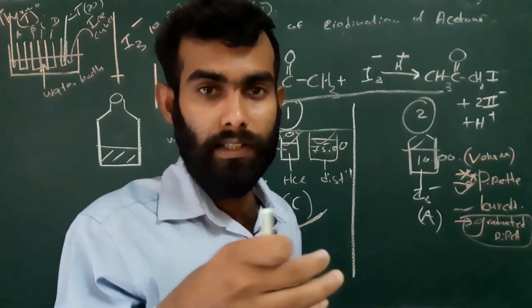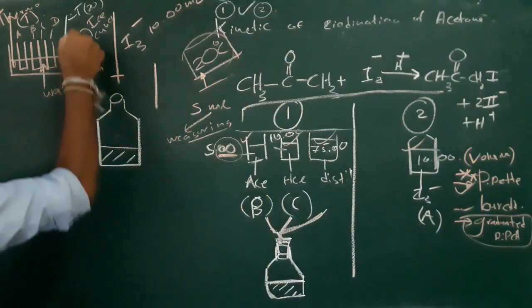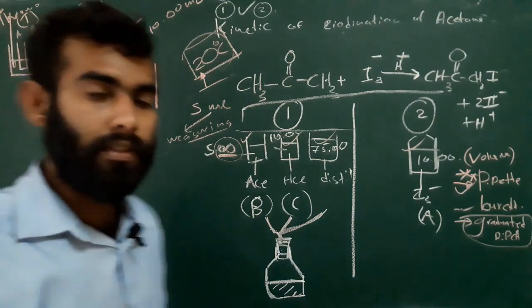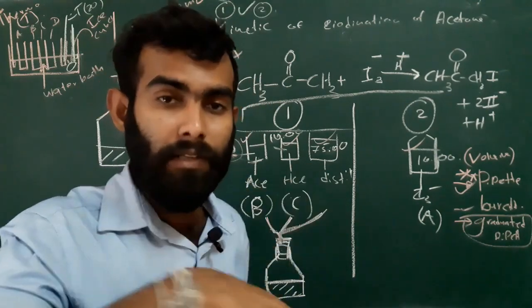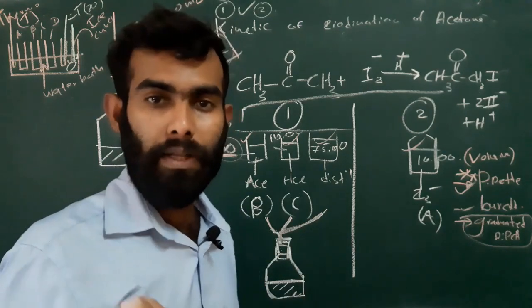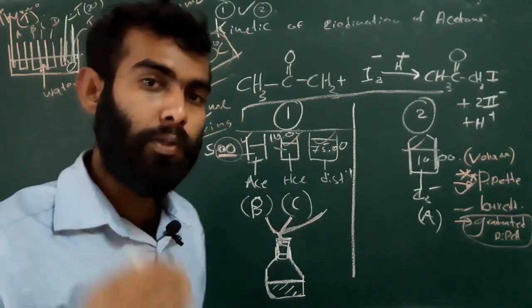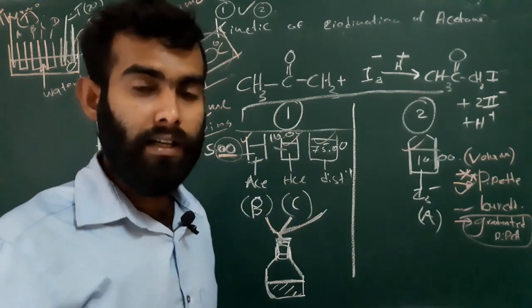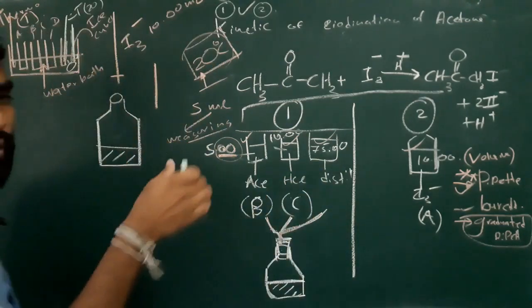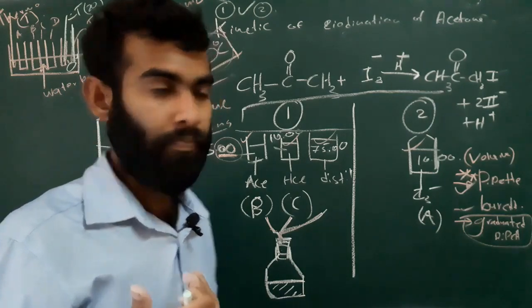We have to shake them. So we have to stir. In other words, we will be using a glass rod, and we will mix the water bath very well to obtain a uniform, homogeneous temperature. After water bath coming to that 20 degrees, we will not add ice further, and we will mix our separate solutions also to get homogeneous solution with unique temperature.